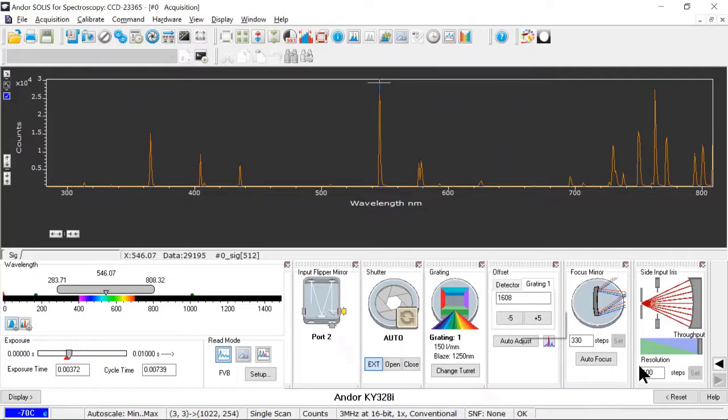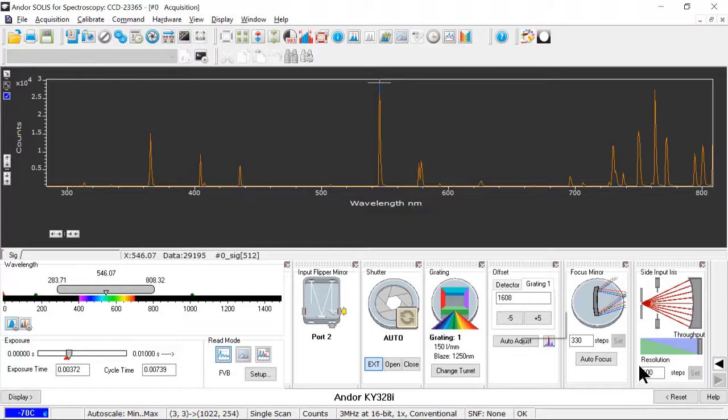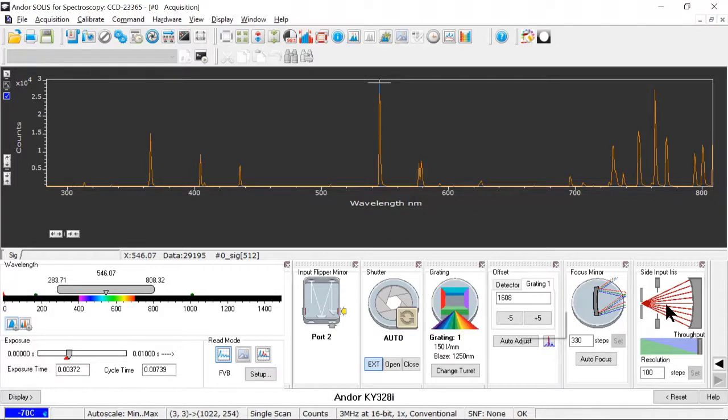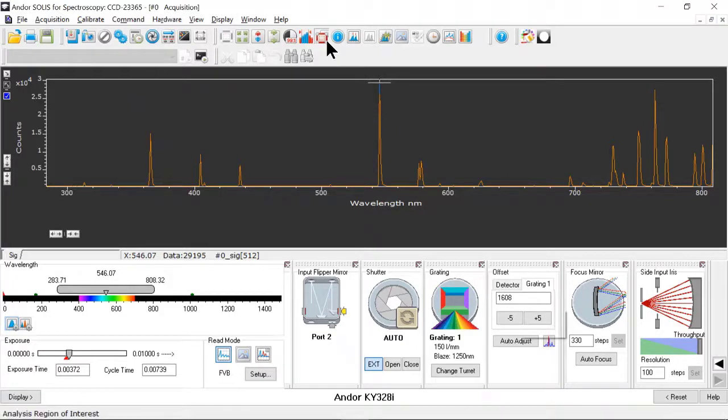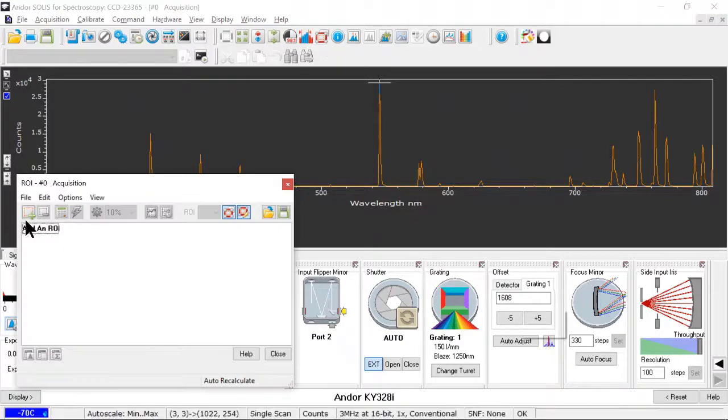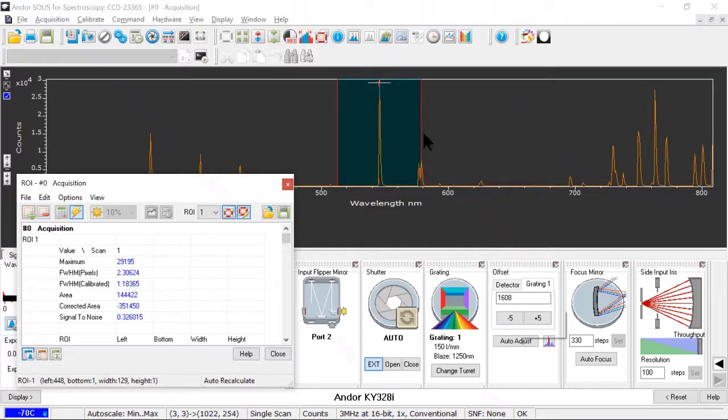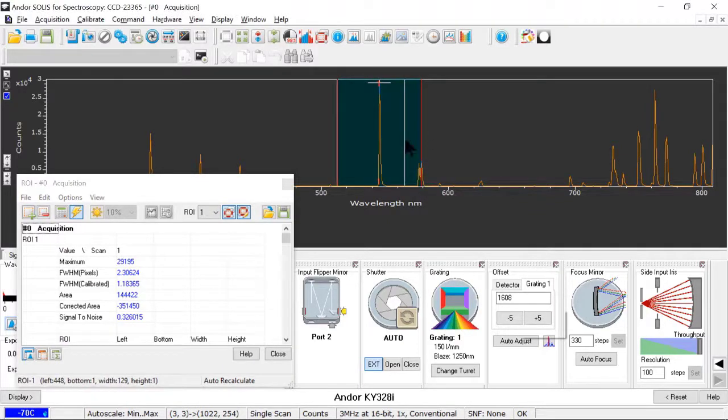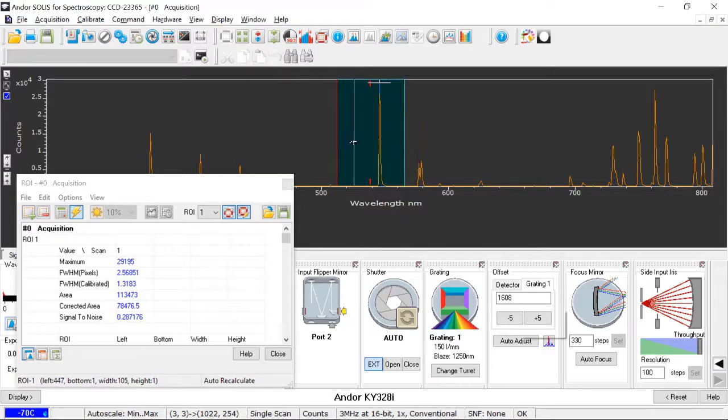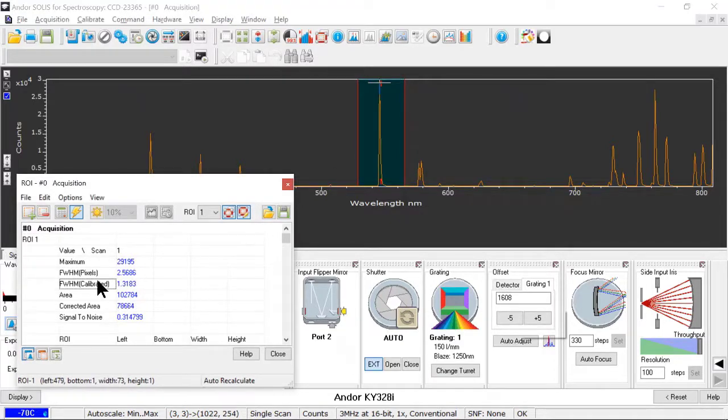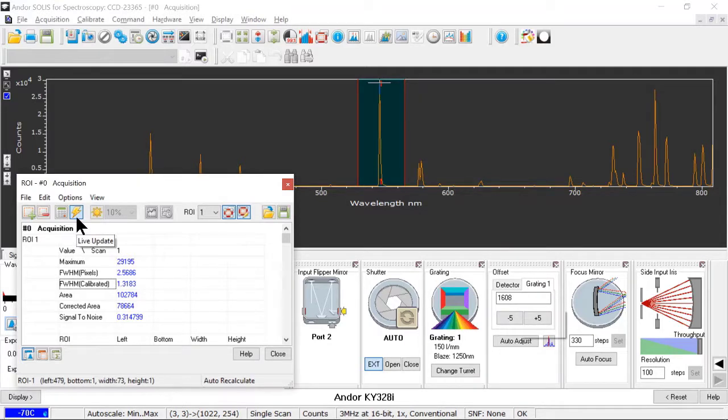Now that I've shown the basics of the SOLIS interface, I'd like to show some additional advanced features. The first is our TrueRes feature, which allows the Chimera 328 to operate as a higher resolution, lower throughput spectrometer. I'll start with the TrueRes iris fully open and check the spectral resolution, which I'm going to measure with the full width half max of this line. So I'm going to create an ROI, a region of interest, shrink it to just surround that line, and then note the full width half max calibrated, which is in nanometers. And it looks to be about 1.32 nanometers full width half max of that line.